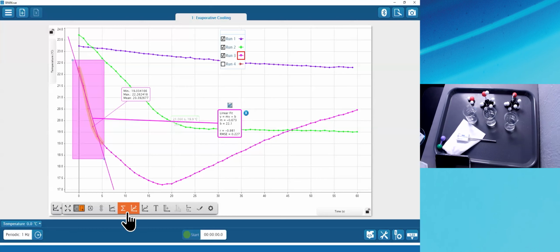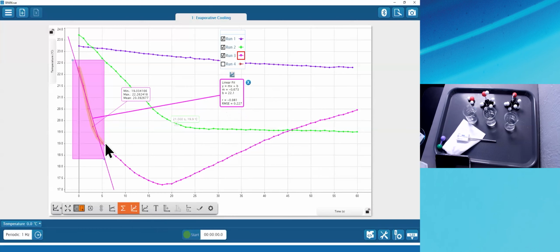And I just put a linear fit because this particular button is specifically a linear fit. Most of the time, you're going to be using a linear fit if it asks you to do analysis with fitting. Why would you be doing that? You might be thinking, well, my students are not going to do that.